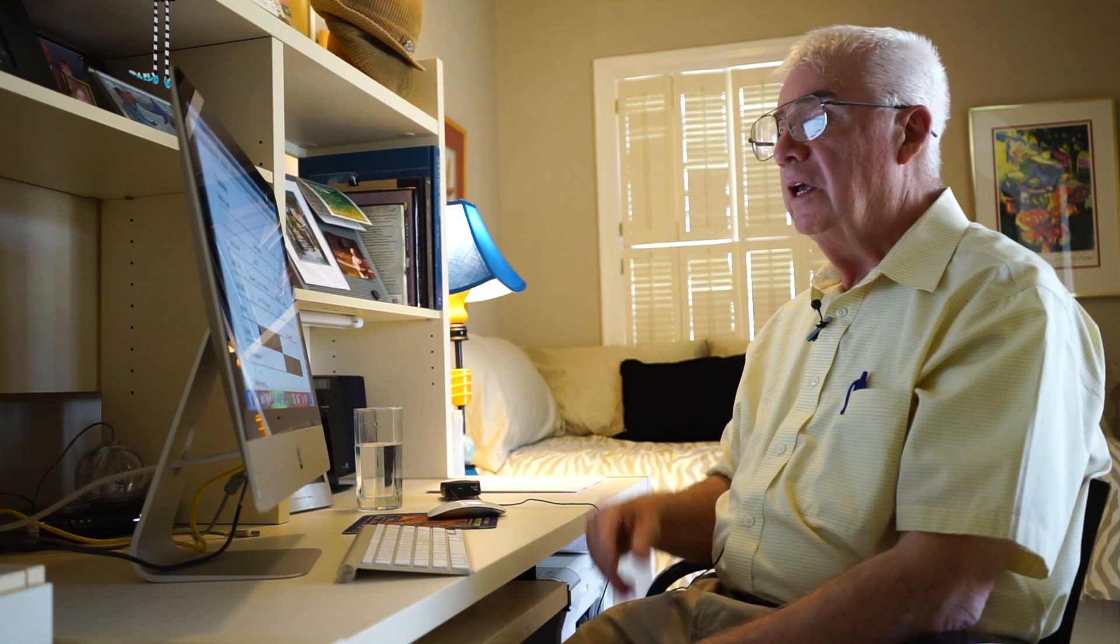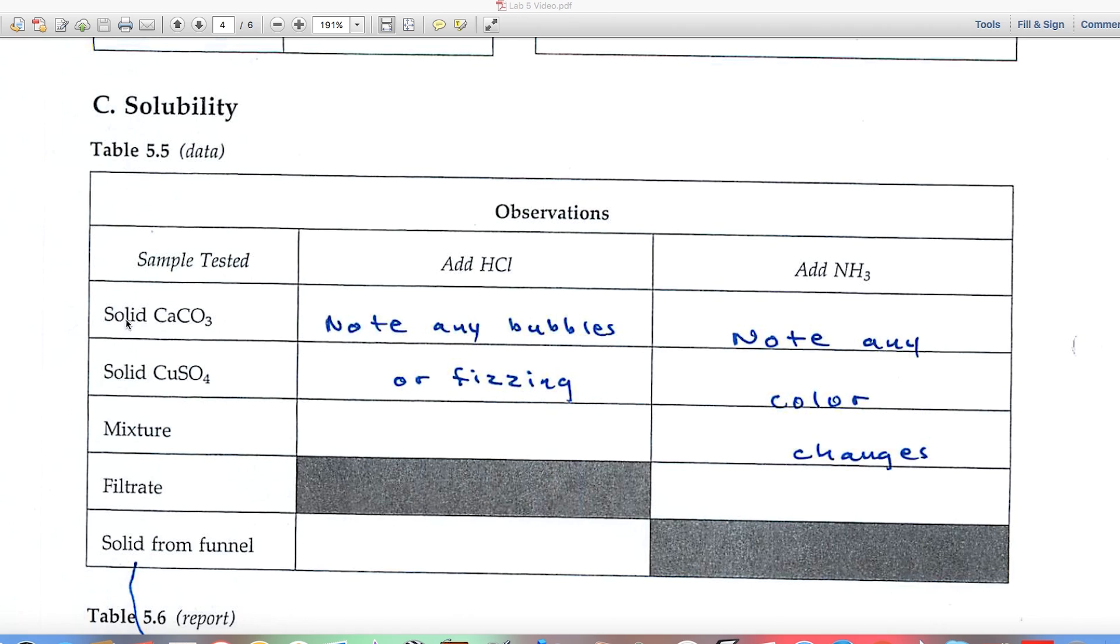Part C is on solubility. We're testing, in this case, calcium carbonate and a new substance, copper sulfate. And one of these two is soluble in water, one of these two is not soluble in water. And we'll separate them based upon their solubility. We're going to collect the insoluble solid in a funnel, and the filtrate is that water soluble substance that passes through the funnel.